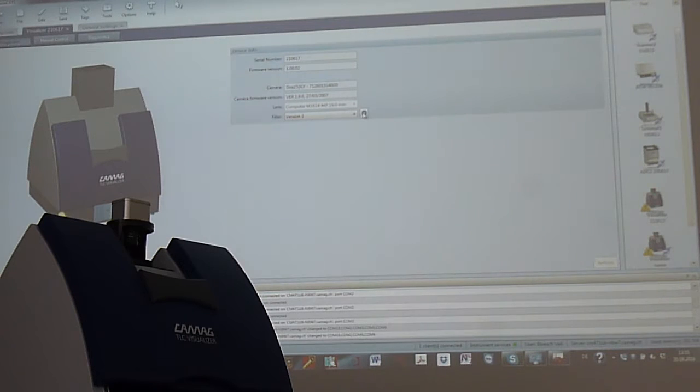We made that. If you go to the information, let me see. There are 3 filters in. So as it is a visualizer 1, you have just the first 2. So it is the metal ring thick and the metal ring thin. So there were 2 different filters. There was no difference in image also. It was a question of we had to source from another company, and they were different, from external.